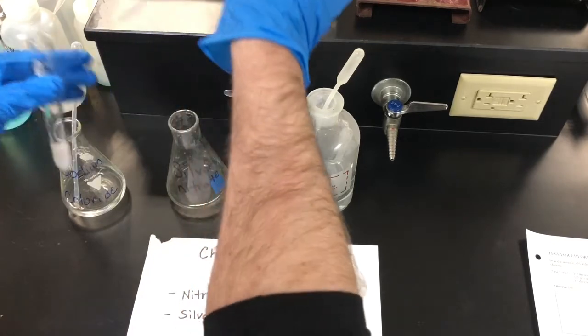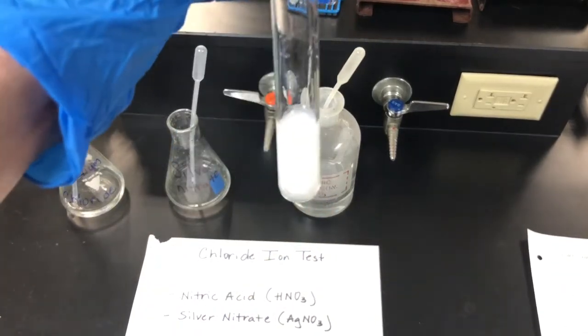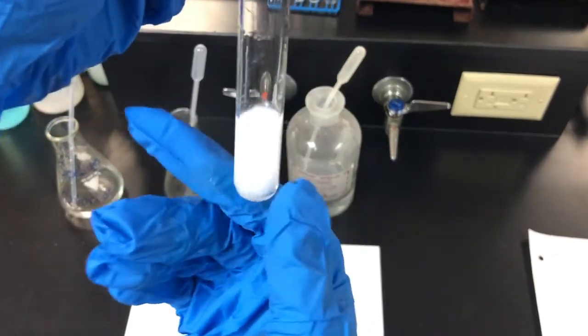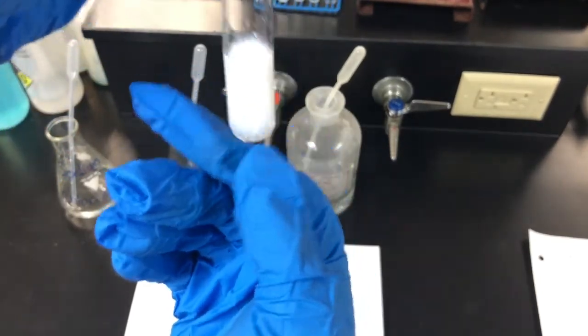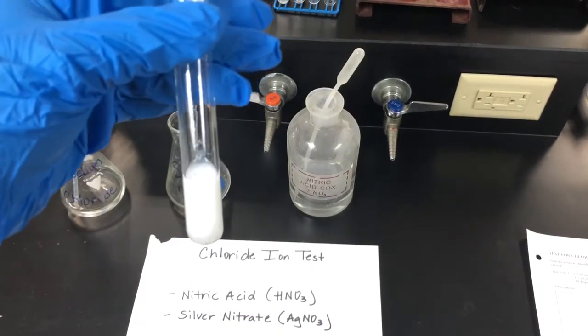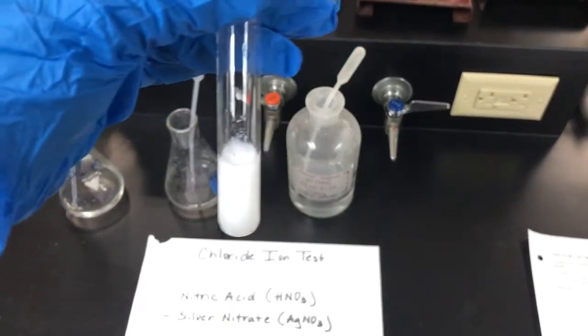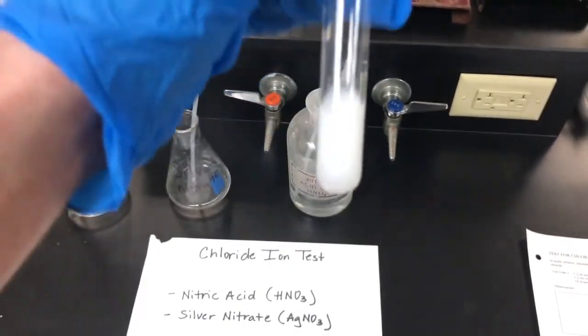Okay. So it forms what we call a precipitate. A precipitate is an insoluble solid that forms whenever you mix two liquids together. So now our unknown will be positive for the chloride ion if it looks like this.